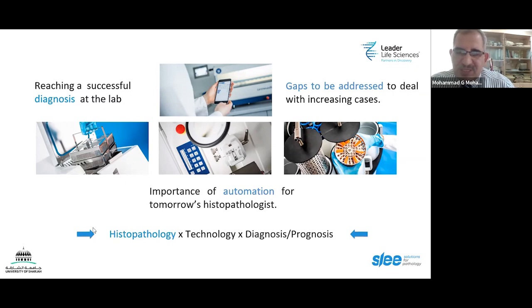Yes, it can accept automation at certain stages, which is the processing of the tissue, but the human factor is needed there. You can't get a robot, for example, to decide during the operation which tissue needs to be processed later on. Maybe now people, as Alex mentioned, are working on artificial intelligence kind of algorithms. So far, to our knowledge, there is nothing that would replace the human factor, especially in getting the biopsies, in trimming the tissues, determining which area of the tissue needs to be processed, the orientation, even the testing of the slides after staining, determining whether these are good slides or bad slides. Definitely it would need the human factor. So I'm kind of against people who are mentioning, even in the medical laboratory field, that automation is now going to replace us, we're going to be obsolete.